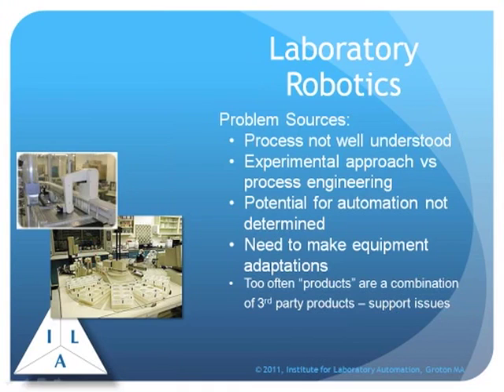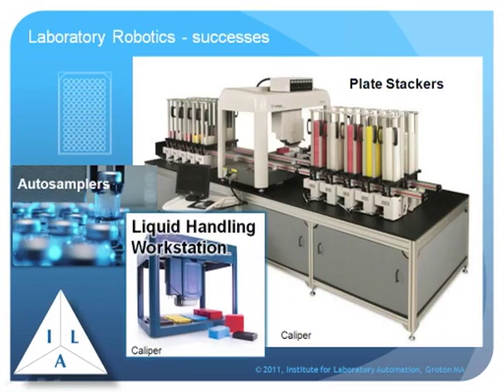Too often, the products that were developed for laboratory applications by third parties were really a combination of products, different pieces coming from different vendors, and this created another problem: support issues. The system may work well when it was first installed, but when any one of the components was upgraded, you ran the risk of having the entire system fail, because the upgrade somehow may change the way the system would work, and as a result, the entire system wouldn't work together. That's changed.